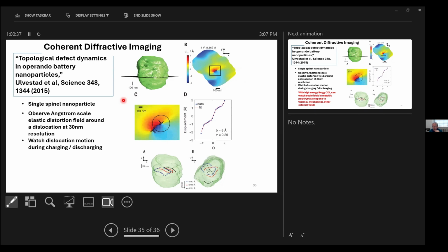They claim resolution down to at least 100 nanometers. I'm not sure whether it's better than that. But that's an expensive measurement because you have to position your optic and your detector for a single diffracted beam. So using dark field imaging reaching to the 100 nanometer resolution. So that's quite impressive. Okay. Yeah, it is. Yeah, I agree.